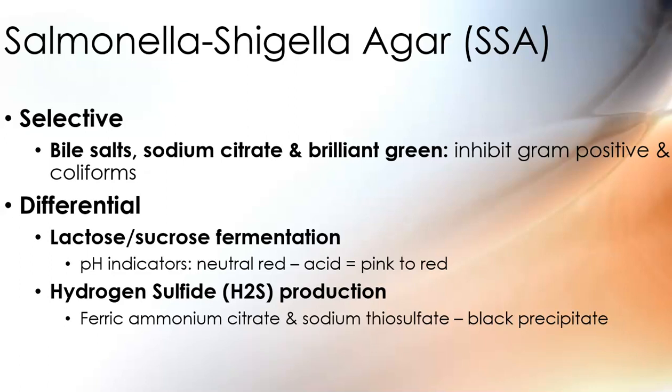Going one more step, there is Salmonella Shigella agar. What makes it selective? It's going to inhibit more than just gram positives. It's going to try to inhibit most of those gram negatives that it lives with as well in the intestines. So, bile salts, is that going to inhibit those coliforms that live in your gut? No, because that's what we want, is to produce that.